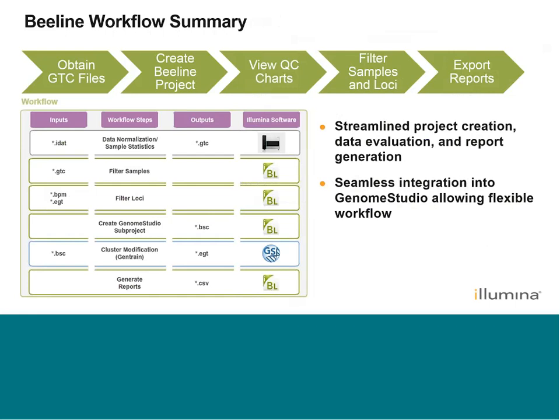That's our summary of the Beeline workflow — getting from GTC files to reports. It's really meant to be a streamlined project creation, data evaluation, and report generation workflow, but also allows for seamless integration into Genome Studio, allowing both software to work within their strengths — the key functions performed better in each software.